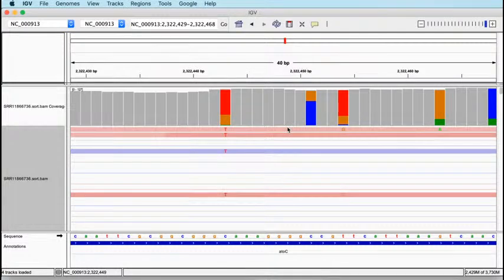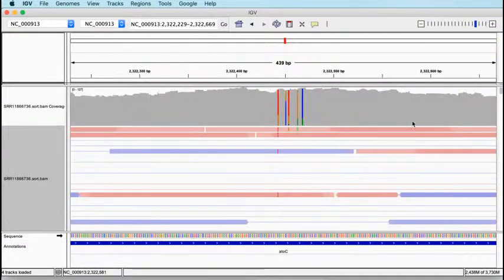So this is a relatively high level overview of IGV and some of its very basic features. It's much more complicated than this as a piece of software, and it would take a long time for me to go into a lot more features, and at this point, without any real reason to illustrate those features, I don't want to go into too much more detail.